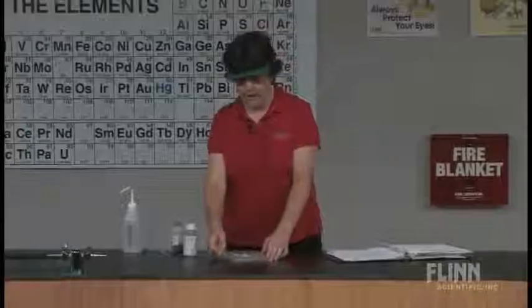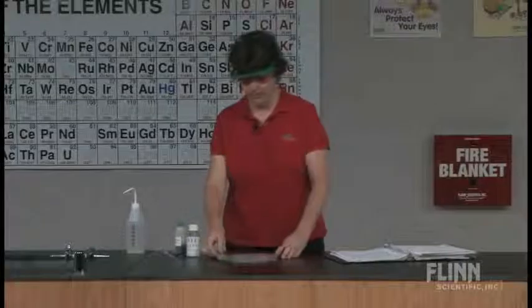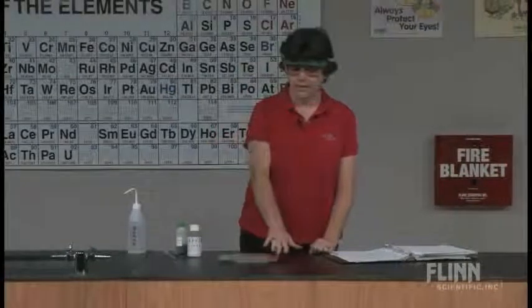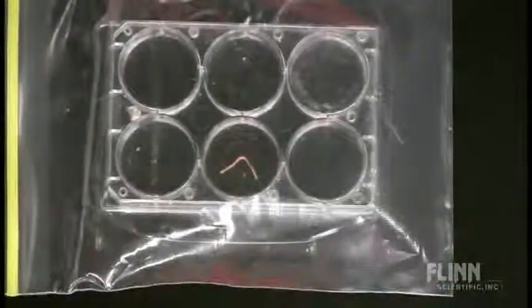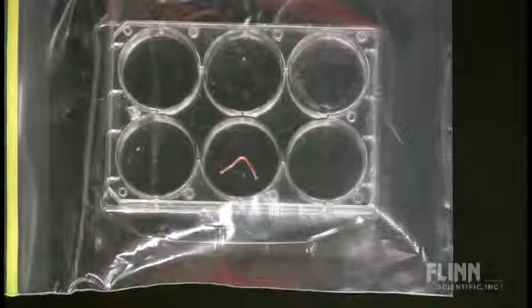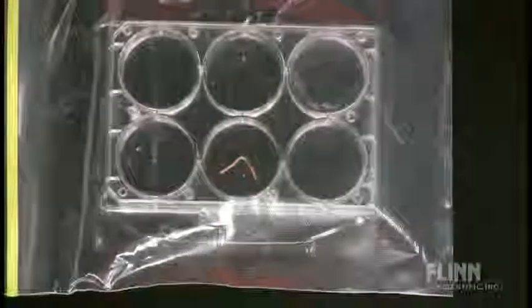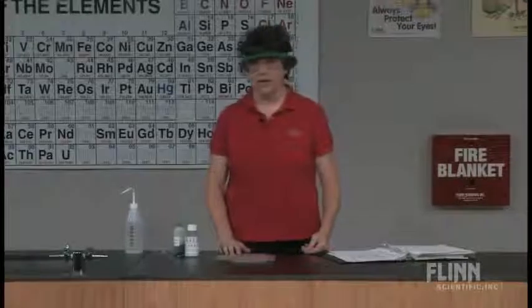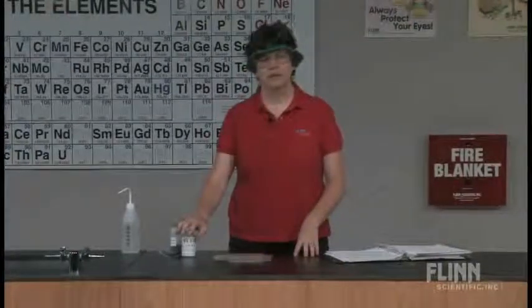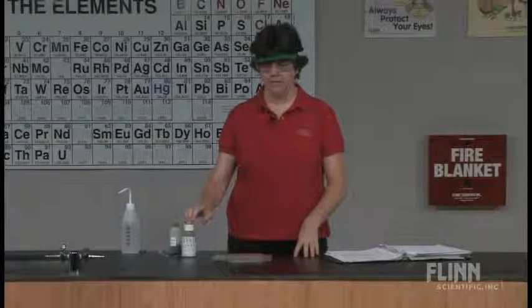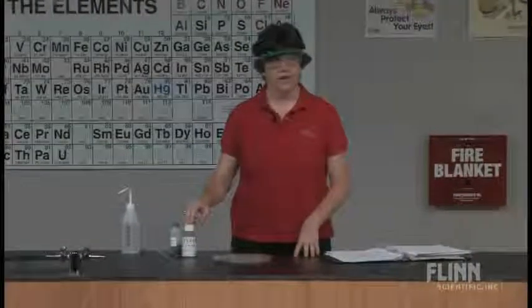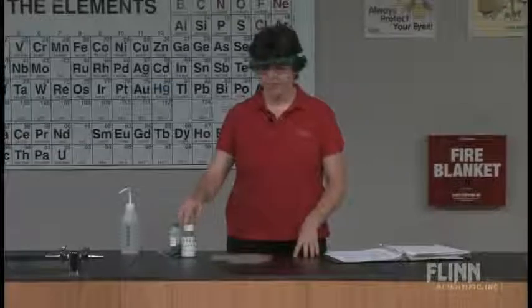I want to put the dish into the bag but I don't want the water to get inside the dish — I want it to be kind of underneath. So I have this big well plate, and there's a puddle of water in the bottom of the bag. Now, we know about limiting reactants, and it's important that your nitric acid is your limiting reactant. You really want to make sure that you have copper left over when you're done, so don't overdo it on the nitric acid.